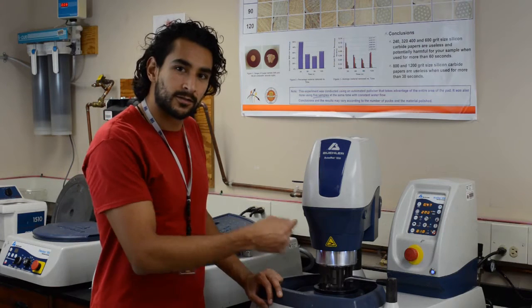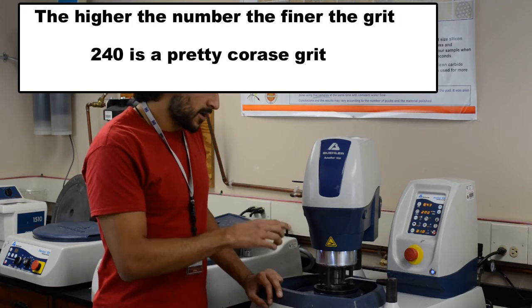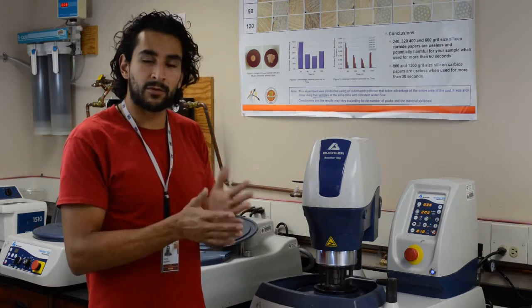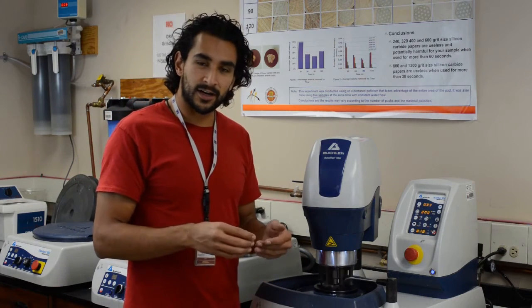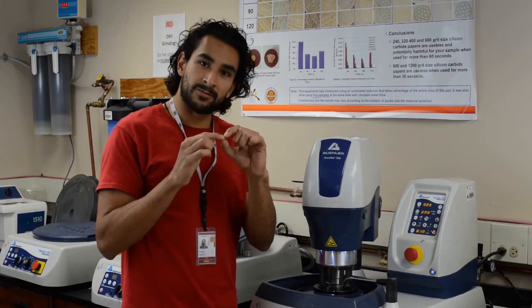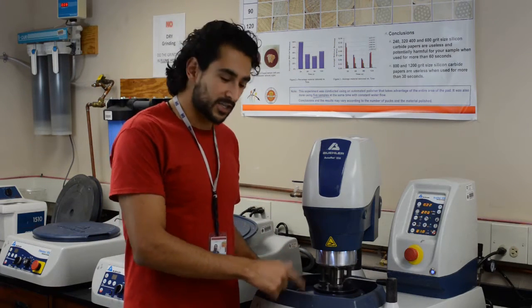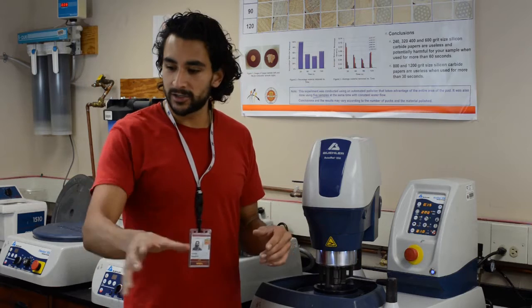Let me see how many cycles of this 240 paper it takes for my sample to start showing a nice cross-section. Remember, I want to stay away from the snip. Some of the samples will still not be showing because only the very tips of them are showing. I want to see how much material it takes at 240 to get a representative cross-section, so I can then start polishing more nicely and go into my finer steps.